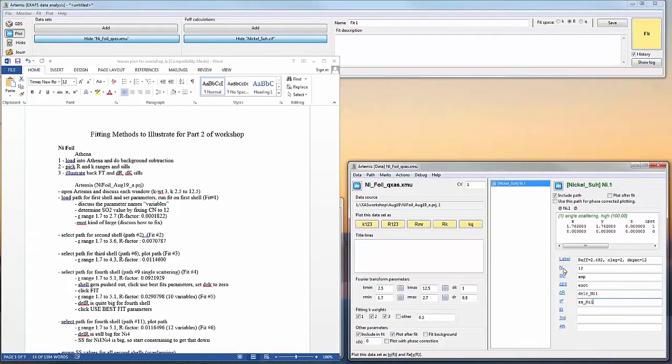So now we have those 5 variables assigned, and we can actually determine our amplitude reduction factor because we know the coordination number. So this is one way to determine your amplitude reduction factor for other samples run at the same time on the same beam line during the same beam trip at the same elemental edge. So other samples run at the nickel K edge. You could use this to determine the amplitude reduction factor for your other samples run at the nickel K edge. It's called chemical transferability. Or this number is chemically transferable to other samples of the same element.